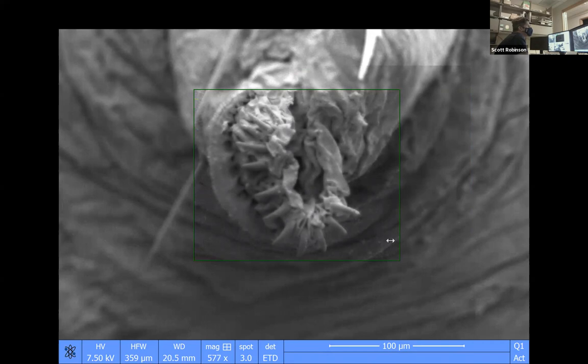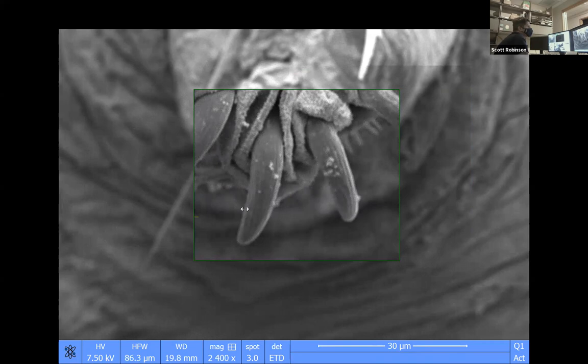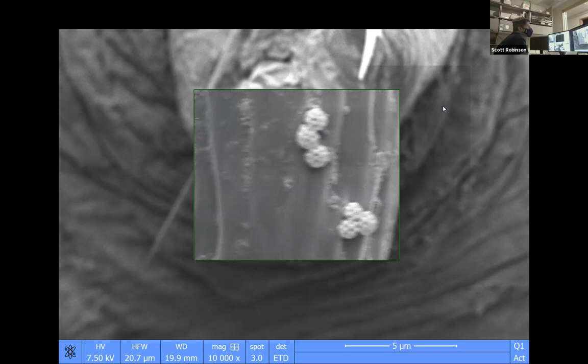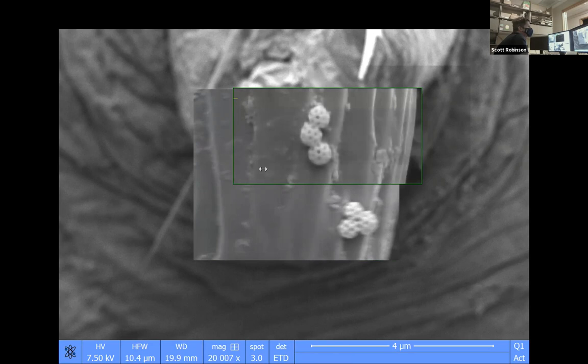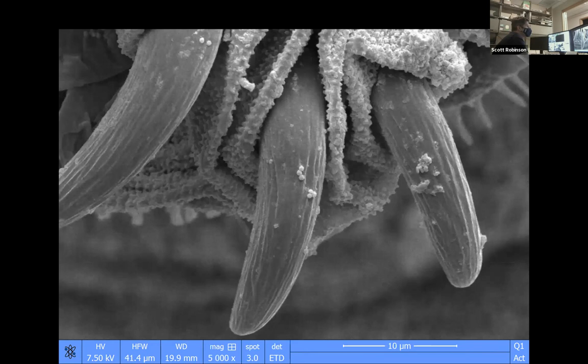And so these are called crochets. Or they're spelled crochets, maybe we're not pronouncing them correctly. And you can actually see some brochosomes on this one. Brochosomes from leafhoppers get on everything. And so we're trying to focus this. This is 20,000 times magnified. Focus is a little bit better right there, and they're still pretty small. So look at those little claws. It's really cool.